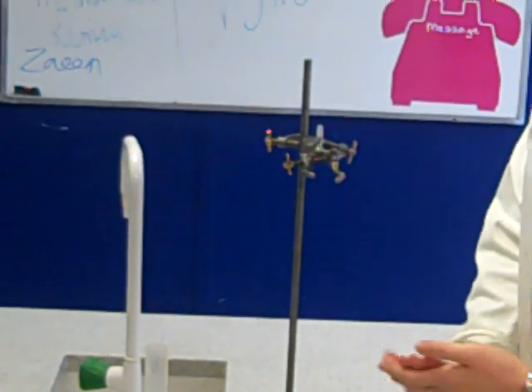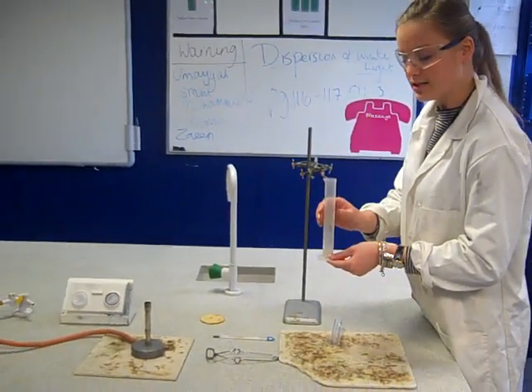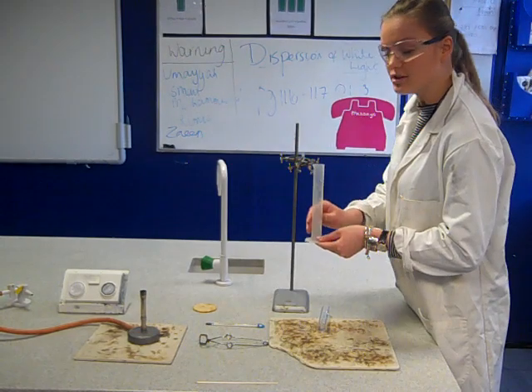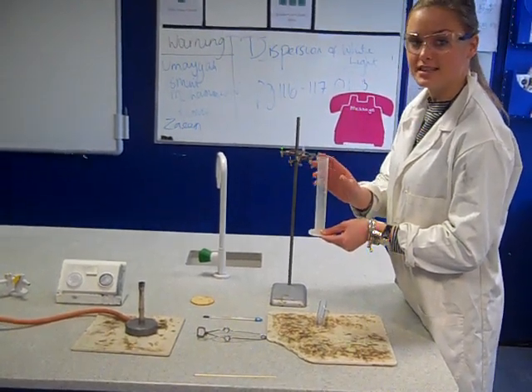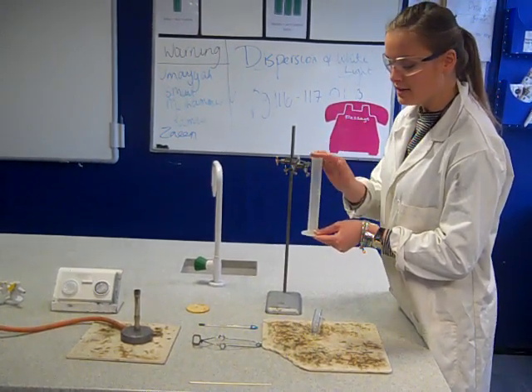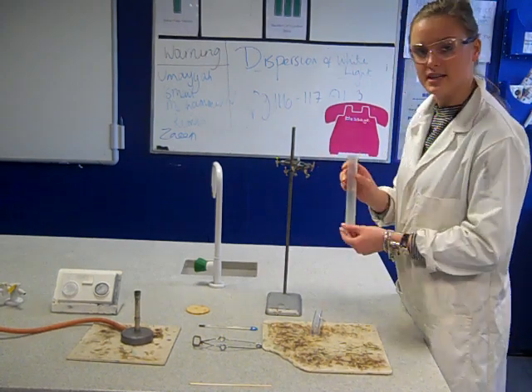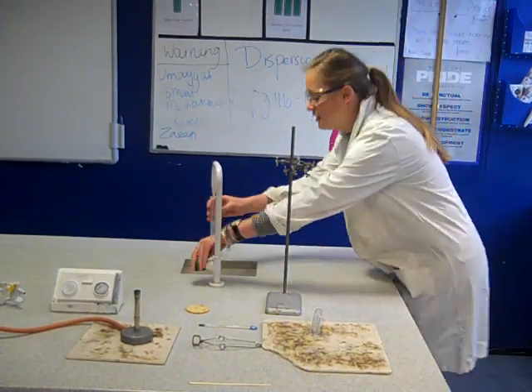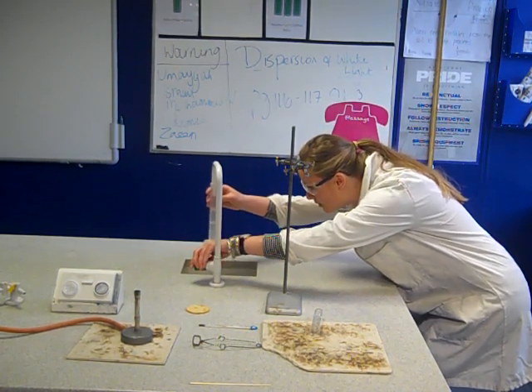Okay, so next thing we're going to do then, we need to agree on a measurement that we're going to measure the amount of water we're going to put in our boiling tube. We know that when we're doing a fair test, we need to keep everything the same apart from our independent variable. So we're going to measure out 20 milliliters of water into our boiling tubes each time. So get down at eye level, make sure you can see the water.